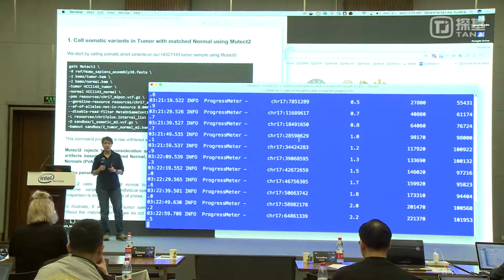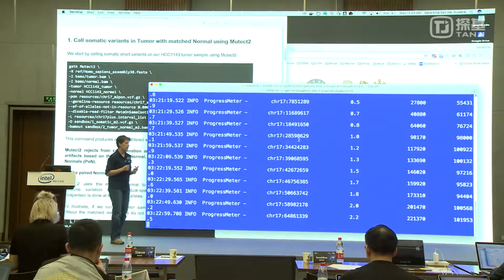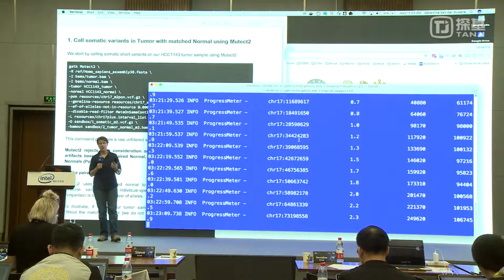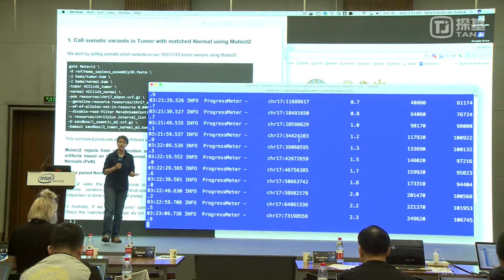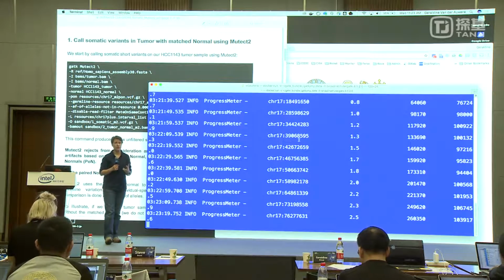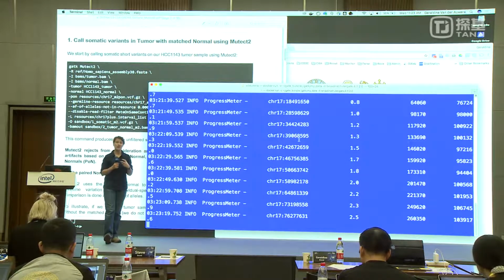That does bring me to an important point that people often ask: why do you not emit germline variants coming out of Mutect? It's doing all this work, it's identifying things that are probably germline. Why not output germline calls at the same time as you're doing somatic calls?